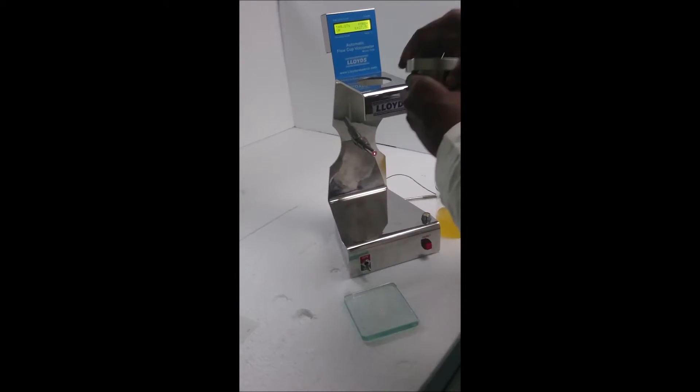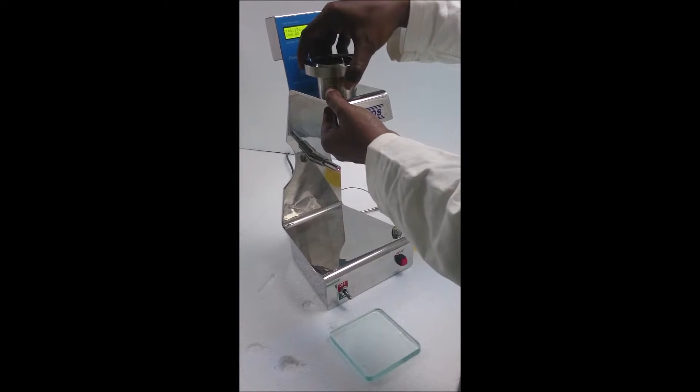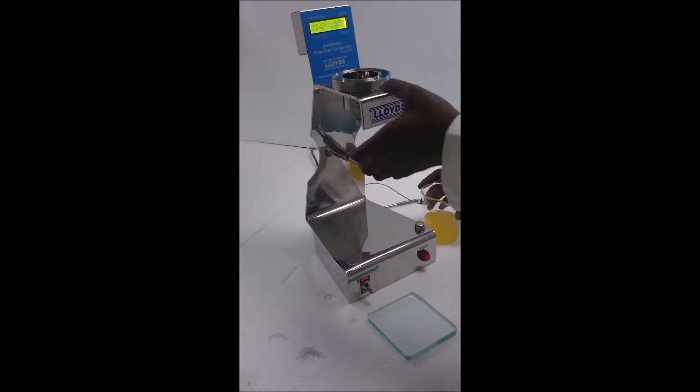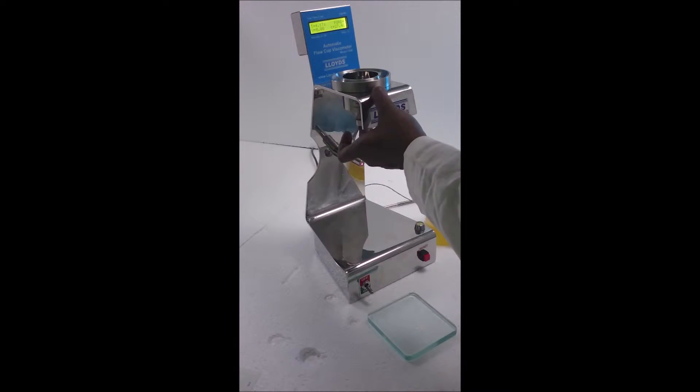The operation of the instrument is very similar to what the user has been using for a typical cup stand but is equipped with smart sensors for automatic measurements and viscosity calculations.